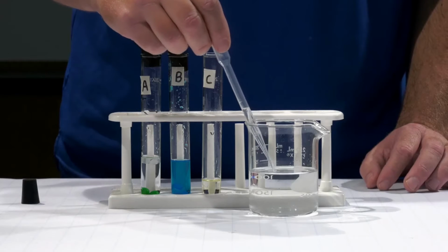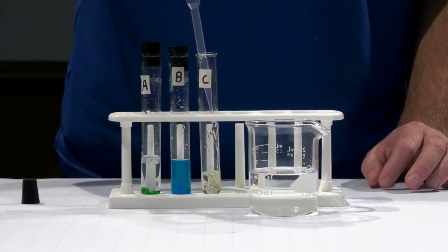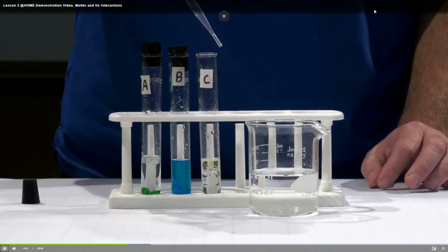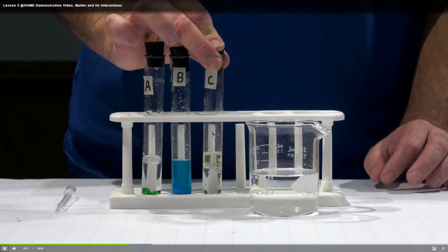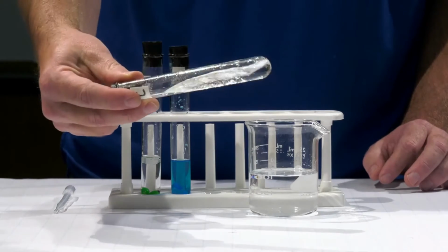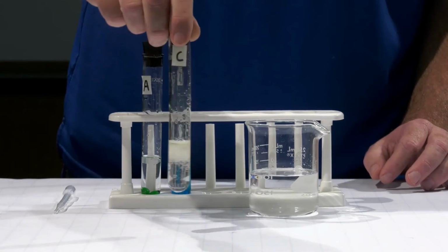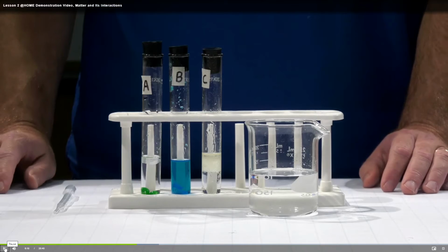Next, we'll add water to mystery sample C. Maybe you notice it doesn't look like water and whatever C is are actually mixing. Then we're going to shake it up and see what it looks like. Do you notice any changes? Doesn't look like water and whatever C is like to mix together.